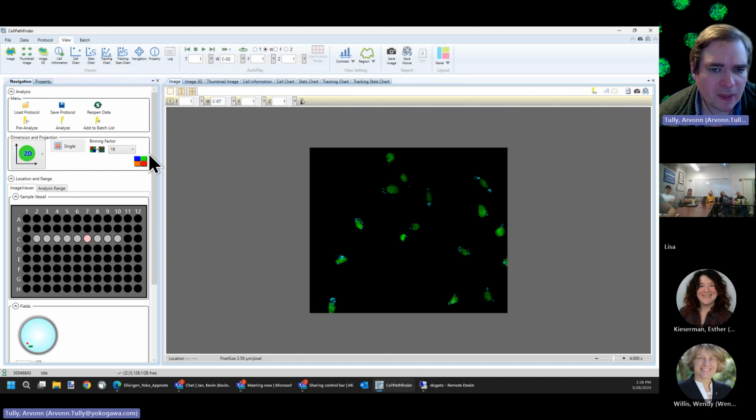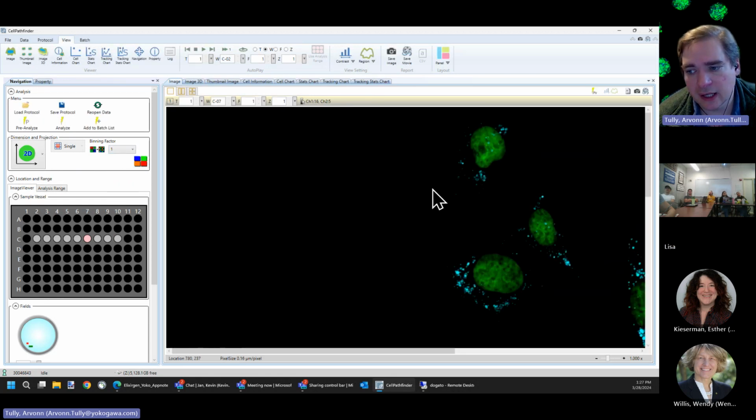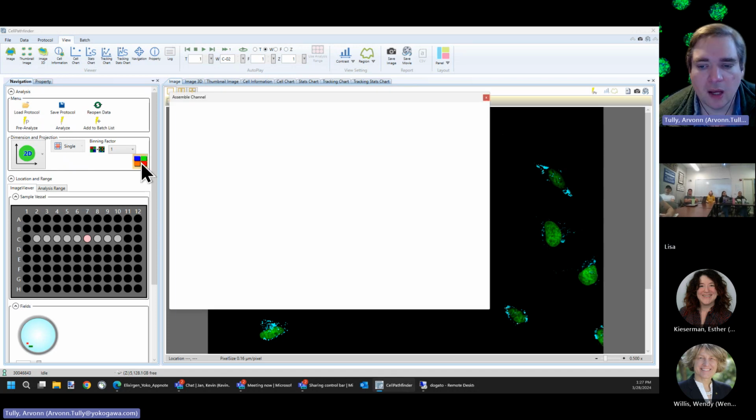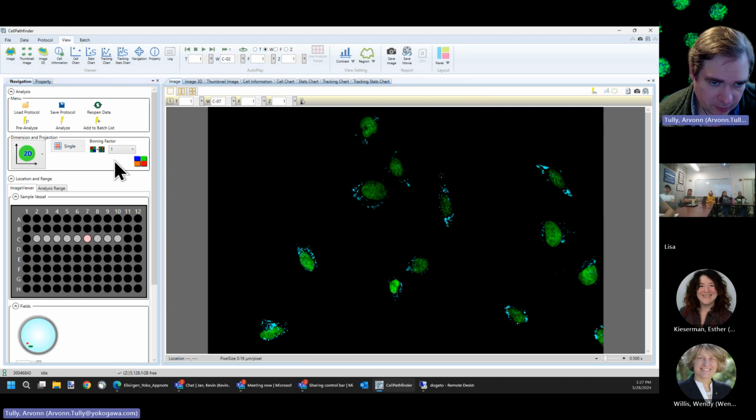It's a little silly. This is really only something you need to use if you're doing a very, very large tiled image, and for whatever reason, it's not going to fit on the screen at once. So you can use that to reduce the resolution of the image. We also have this button here, which is poorly labeled. What this does is it allows you to assemble the image either by switching from a max intensity projection to slices if you have that data. If you don't have that data, it's not something you're going to change. I want to mention that there.